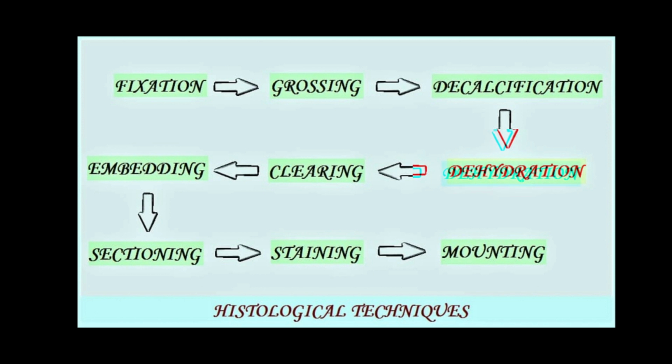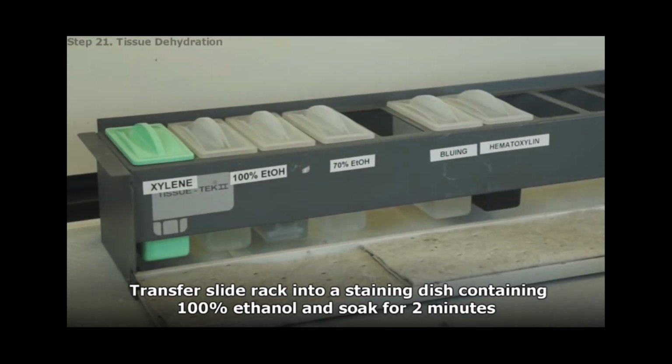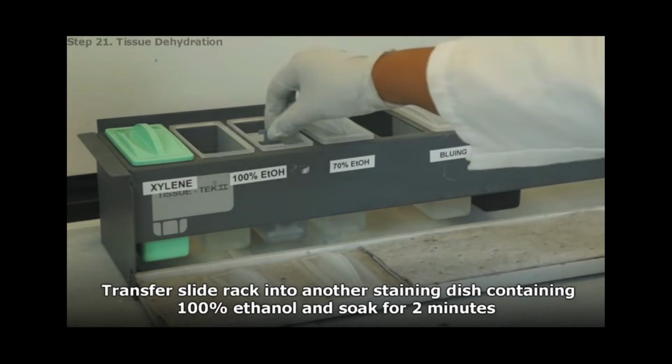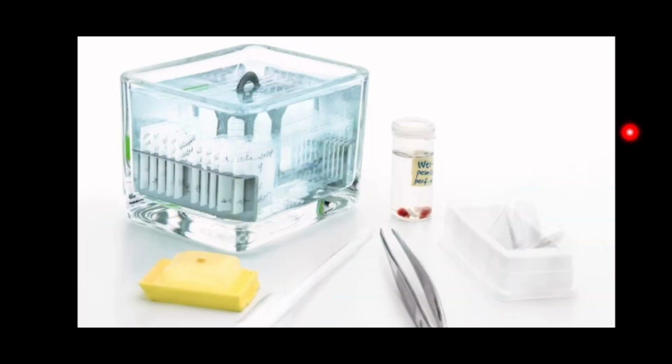Next is dehydration. So remember that dehydration is the process of removing intercellular and extracellular water from the tissue following fixation and before wax impregnation. So I think that's enough for our brief recap. Let's proceed to clearing.